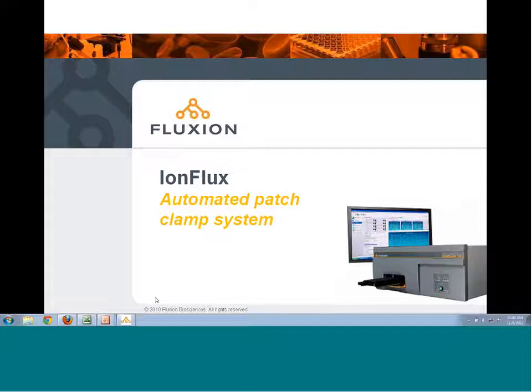This morning's webinar will be primarily focused on the software interface, which we believe is intuitive and easy to use in controlling the IonFlux system. I was going to highlight several of the features, and in today's webinar, we'll be looking at the software in real time, although I don't have a system here that's actually running an experiment, so some of those details will be presented but not actually seen.